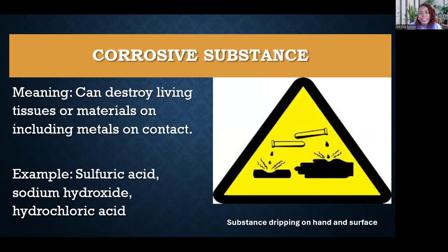The next substance we're going to look at is corrosive substances. You can see it's a triangle with a substance dripping on somebody's hand or on a surface, and this means that the substance can destroy living tissues or materials, including metals, on contact. Examples include dangerous fluids like sulfuric acid, sodium hydroxide, and hydrochloric acid.